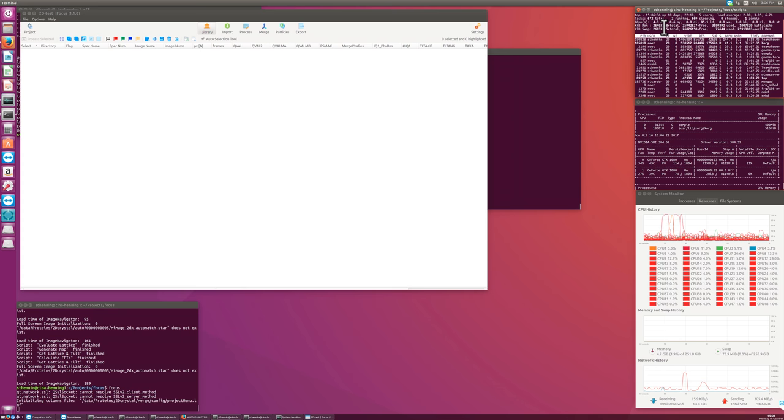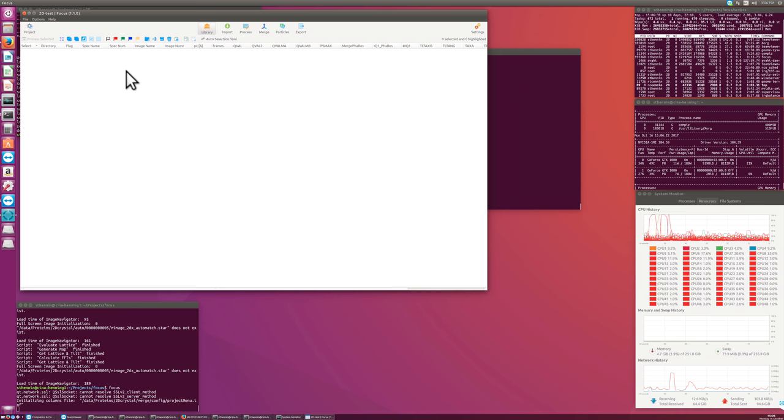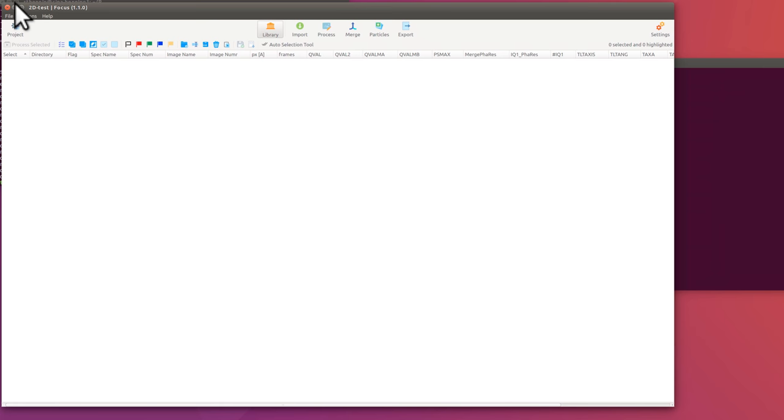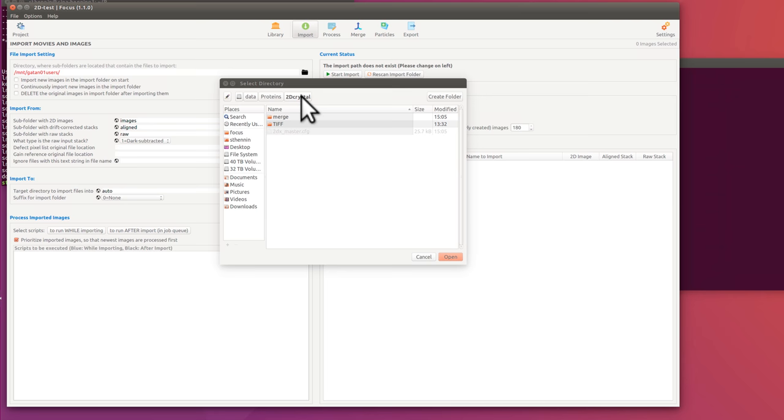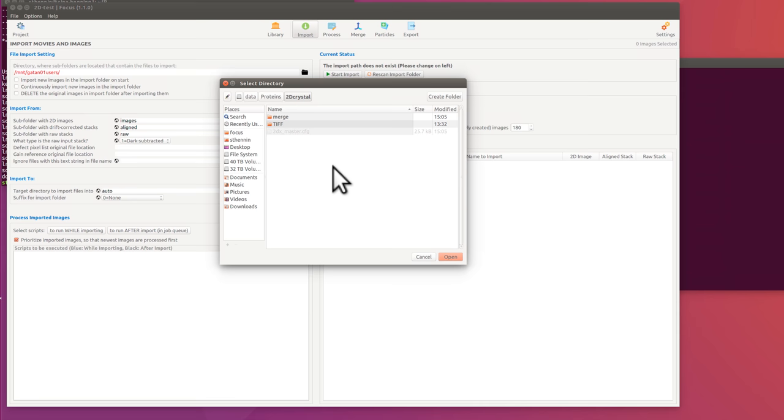When we launch Focus, we end up in this library view. And there's nothing at the moment, because there's no files imported. So you want to import them. And I go to the Import section now. And we have to tell here, top left, where we get these proteins from. And they should actually stay right here, because this is where our TIFF folder is. So we are importing now from the same folder where we will work on. Usually you wouldn't do this, but for now we do it.